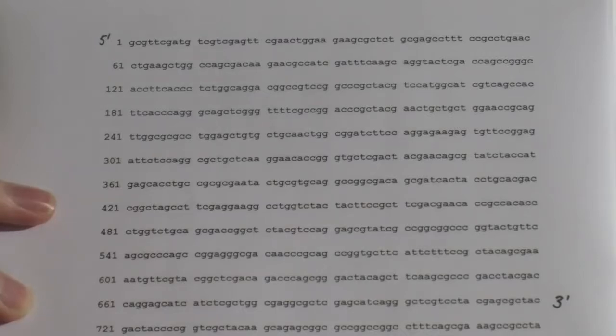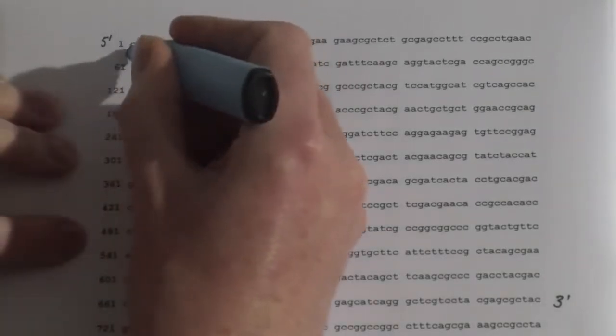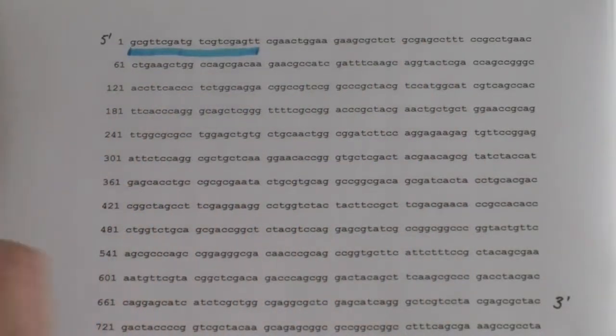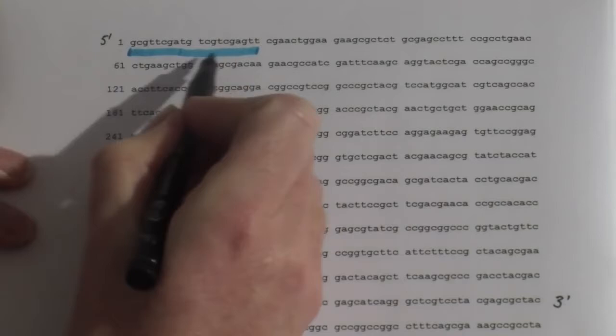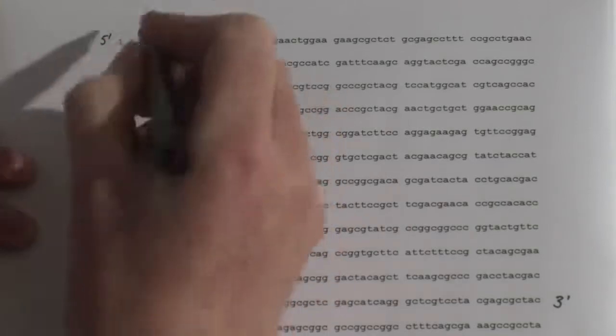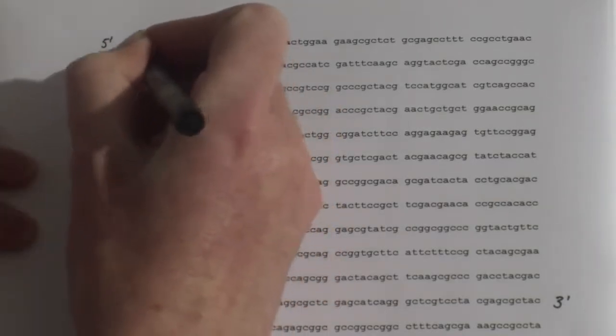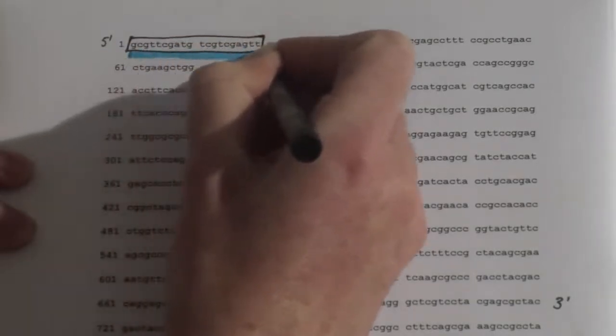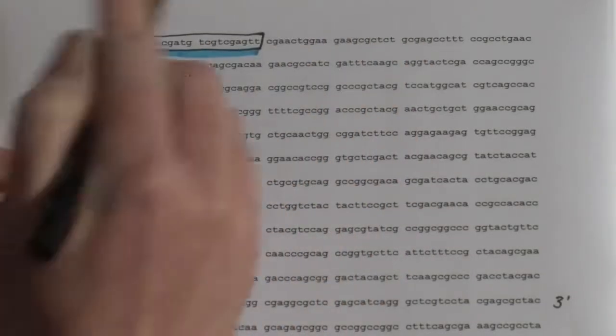So if I was wanting to design another pair of primers to amplify a piece of DNA in this section here, I can imagine that my DNA binding site actually has to be the complementary strand of DNA that is running here, that we have not been shown. And if this is my binding site, my forward primer is the sequence that I'm shown here. The forward primer is straightforward.